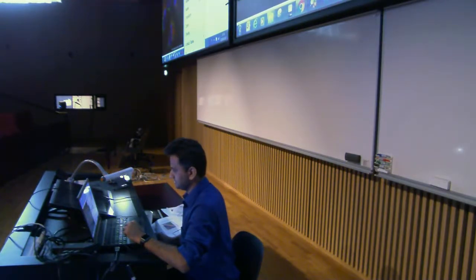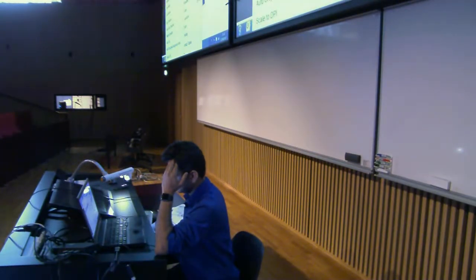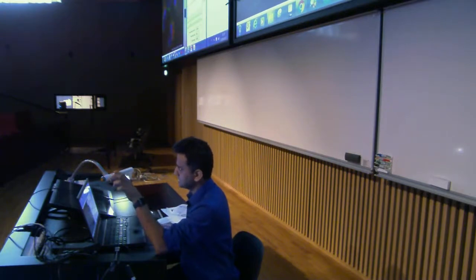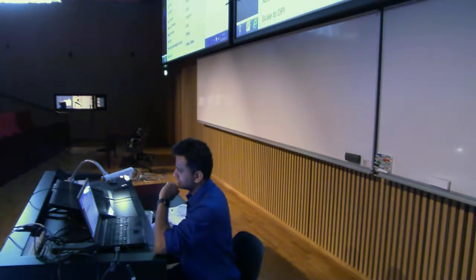Image crop duplicate. Process contrast. Yeah, the color thresholding, that's important. Okay, so far what we have seen is just the grayscale thresholding, just one channel at a time. There is also the possibility of doing thresholding in the color mode. So how do you do that? You just go to image, adjust, and then this color threshold.